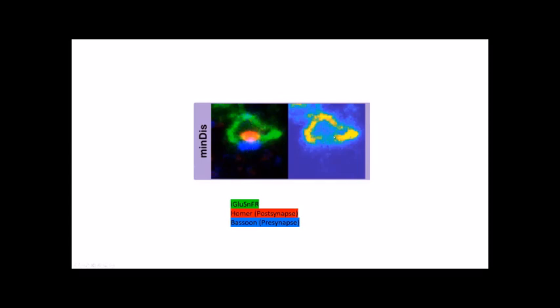In these images, we noticed these conspicuous gaps in indicator labeling right at the postsynaptic density. Of course, there are always gaps in membrane labeling in our experience with expansion microscopy, and they're more or less randomly distributed. But looking at lots and lots of synapses, we noticed this gap, and so this led us to hypothesize that the surface display construct that's used to put iGluSnFR on the membrane is actually excluded nanoscopically from postsynapses.